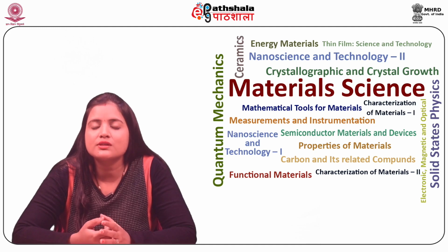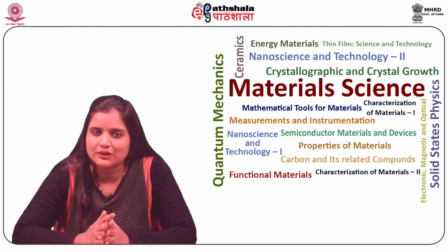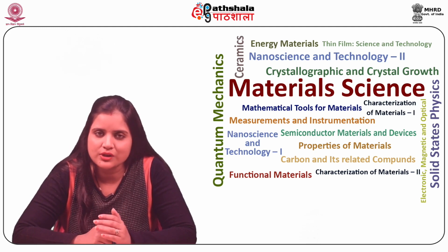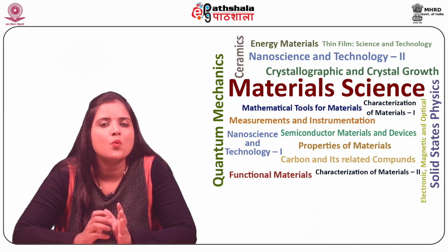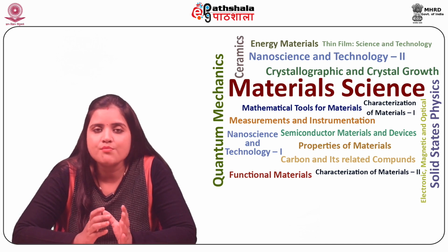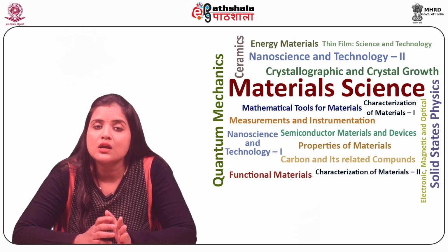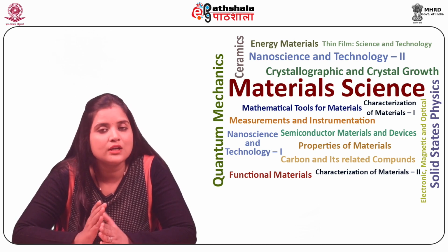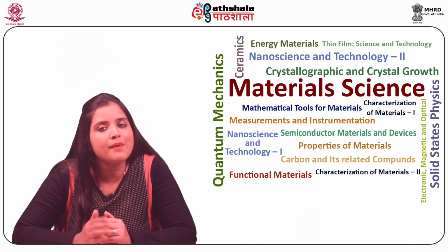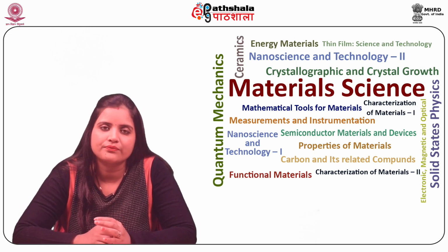We will now discuss the comparison method, the quickest routine analysis method, involving comparison of the microstructure images, that is micrographs, with a series of standard charts. Almost all modern microscopes include facilities to insert standard templates reproduced simultaneously with the sample, thereby leading to rapid and easy comparisons.